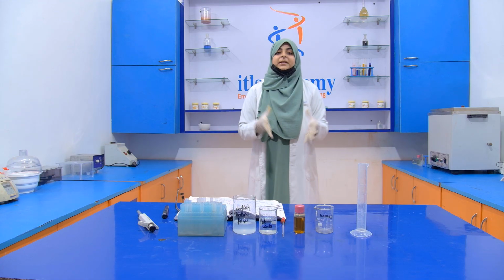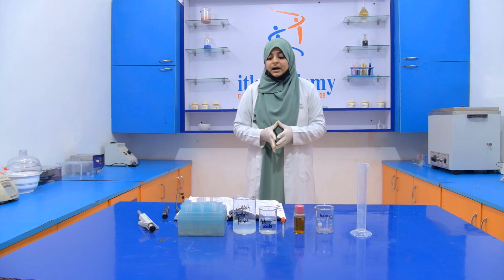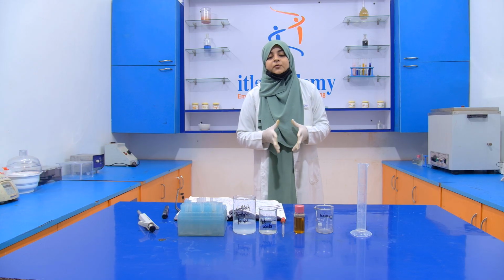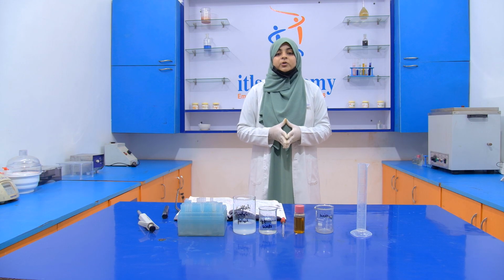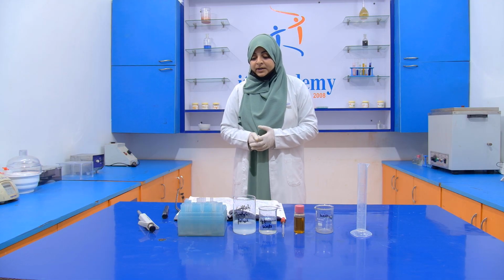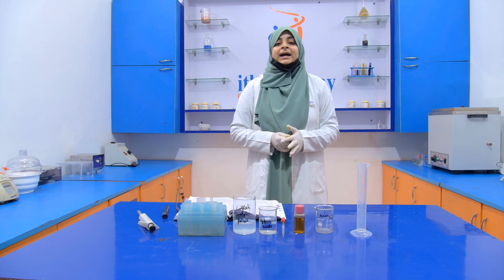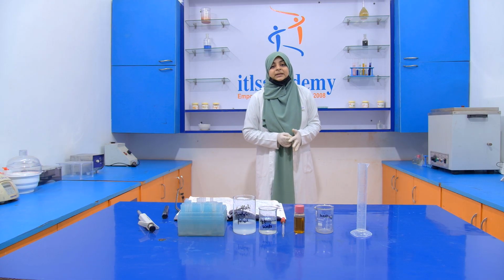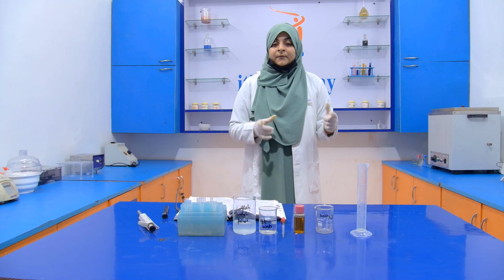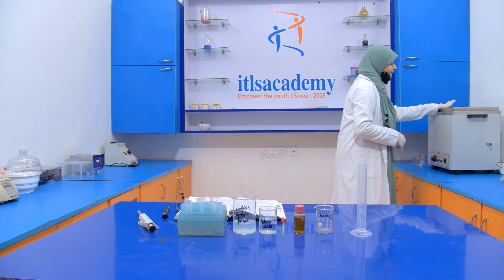Alcoholic potash is prepared by adding potassium hydroxide pellets into 2 ml of distilled water. We take 8.6 gram of potassium hydroxide and dissolve it in 2 ml of distilled water. Then we make up the volume to 100 ml with the help of aldehyde free alcohol. Then this reagent is known as alcoholic potash. One more instrument is also required for this experiment, that is a hot water bath.